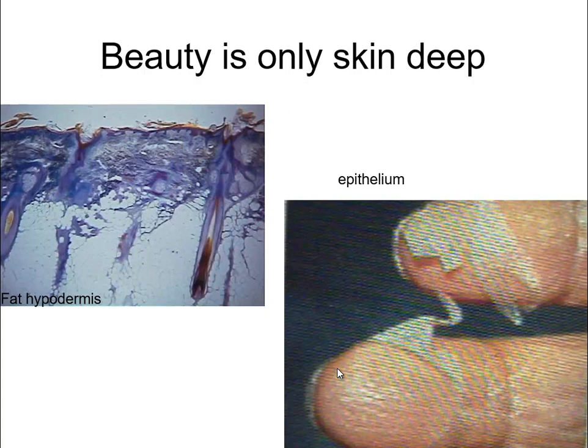Here's another picture showing someone shedding their skin. This person has a lot more fat in their hypodermis than the previous picture. Again you see the dead squamous epithelial cells coming off the top. This is what I mean about looking at a cross section — you can see many different kinds of tissue. Whenever you see empty-looking cells, you're looking at fat, at adipose. It's one of the easiest things to identify because there's nothing visible inside — even the nucleus is squished over to the side.